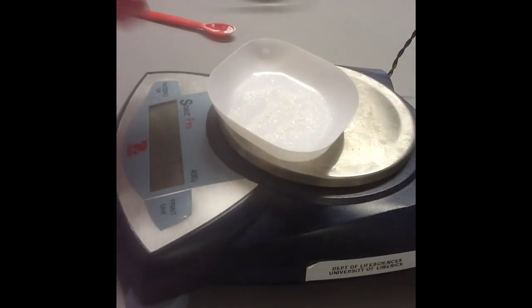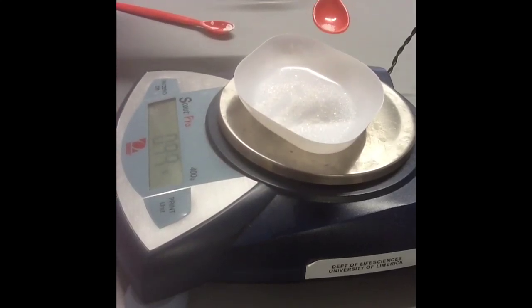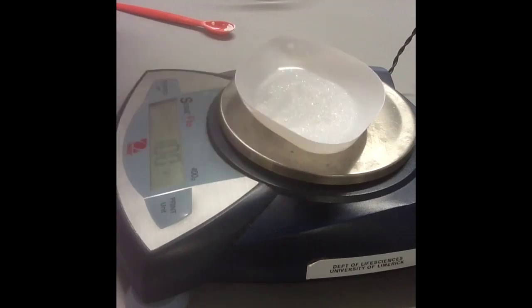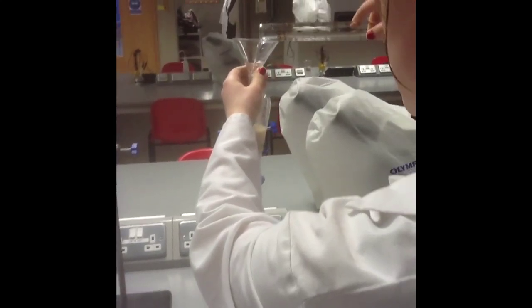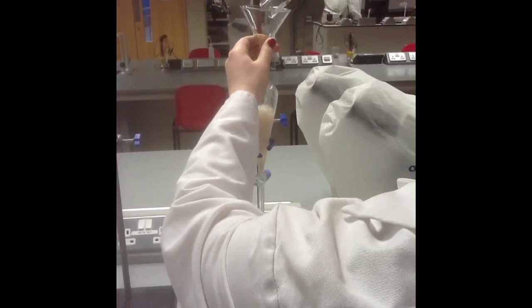For the next procedure we need to create a 1% sucrose solution. To do this we weigh out 1 gram of sucrose. This will be added to 100ml of water. Pour 50ml of the sucrose solution into each separating funnel.